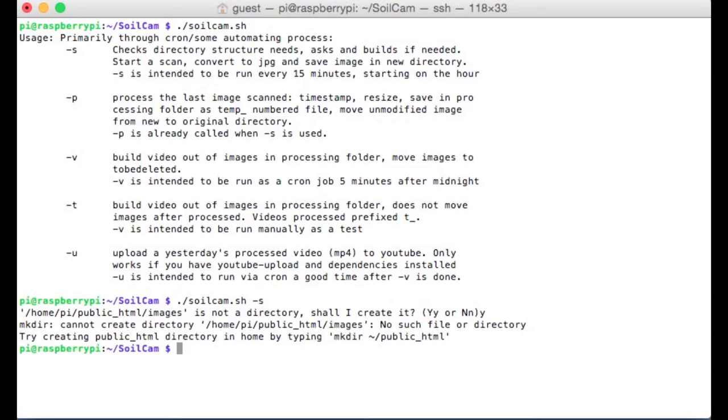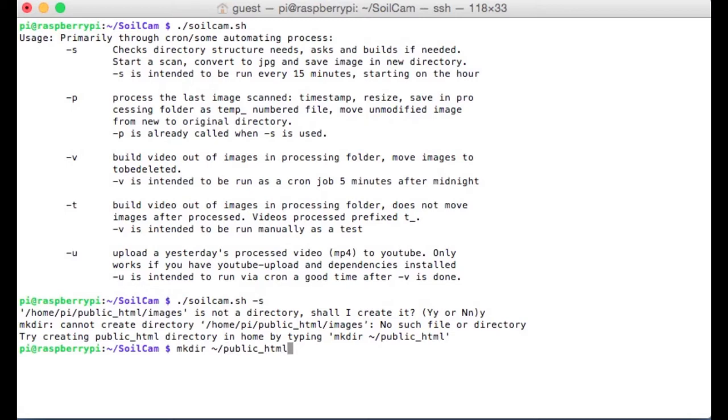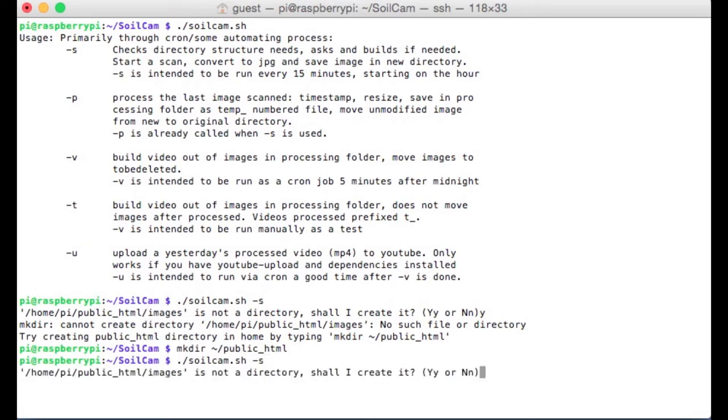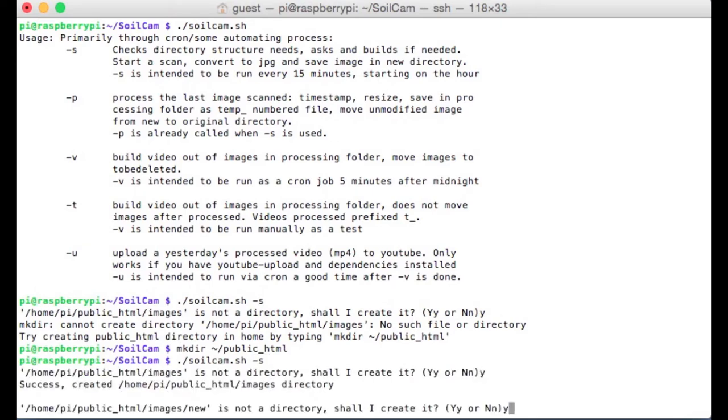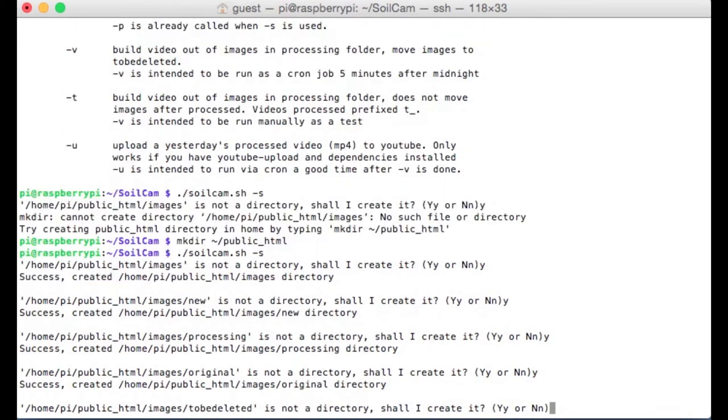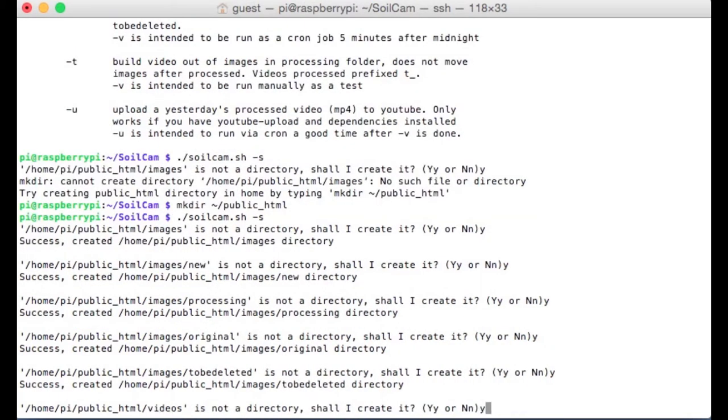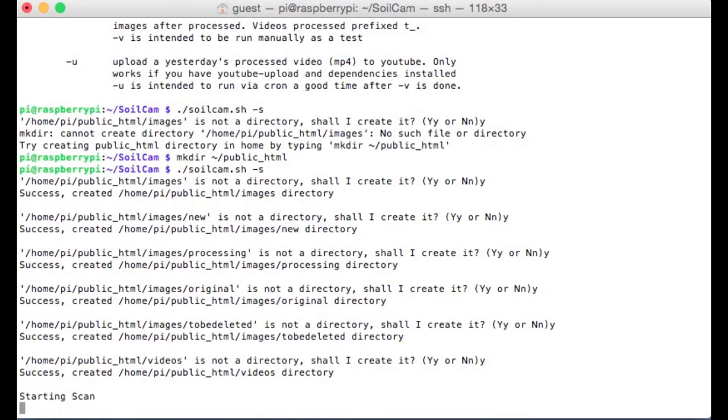It says you haven't created the directory public underscore html yet. So type mkdir tilde forward slash public underscore html. Now that that directory has been created, let's go ahead and try and run this soil cam script again. It's going to ask you that about five or six times. Last one, video directory, let's create that. If you don't create those, the program's just going to exit. Now it's initiating a scan.